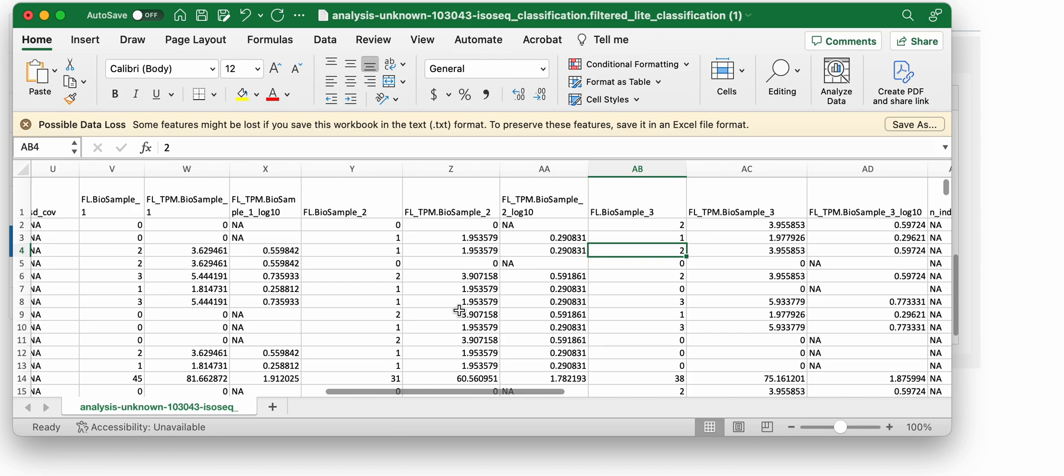If we scroll down here, in this area, we can see that for each isoform it shows the supporting full length read counts, both in terms of raw counts normalized by that sample and also in log 10 for each of the samples.